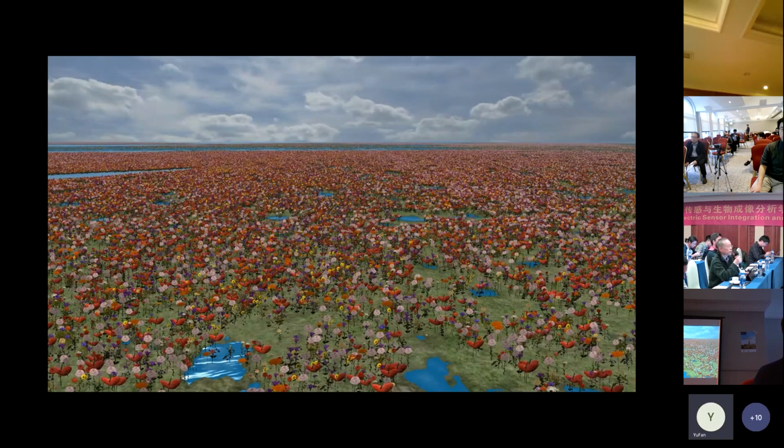Does this puncta mean anything? Is it associated with a neuron or a junction? What does this puncta mean?